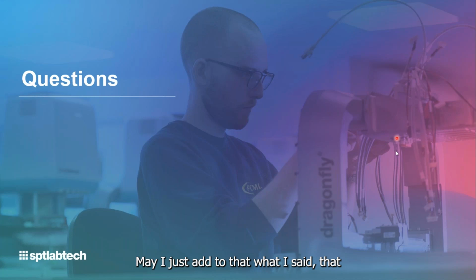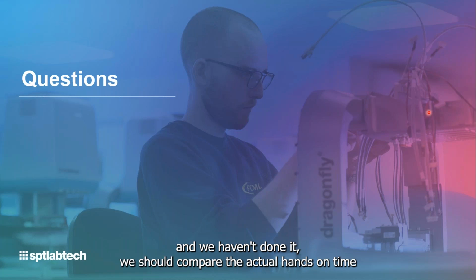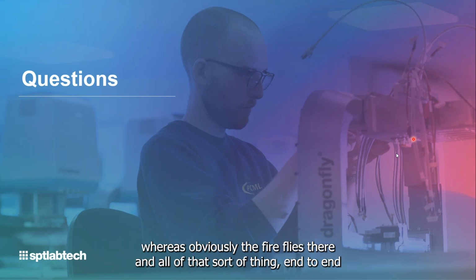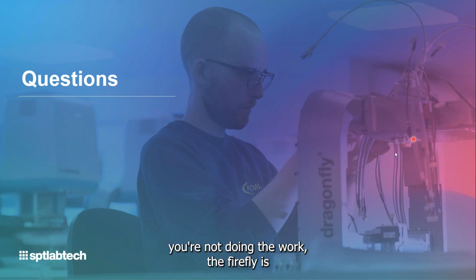Maybe just add to that as well, that obviously the hands-on time, and we haven't done it, we should compare the actual hands-on time, because once you start the run, that's the time you'd normally be operating manual pipettes, whereas the Firefly is doing all of that. So I think end to end, it's similar. It's just that there's an awful lot of that time where you're not doing the work, the Firefly is.